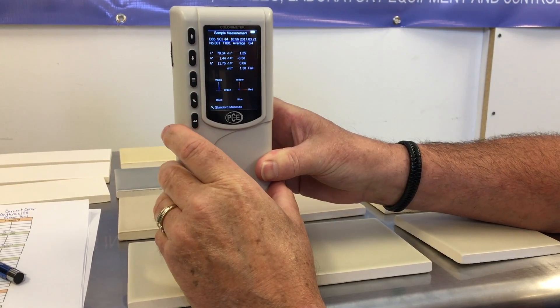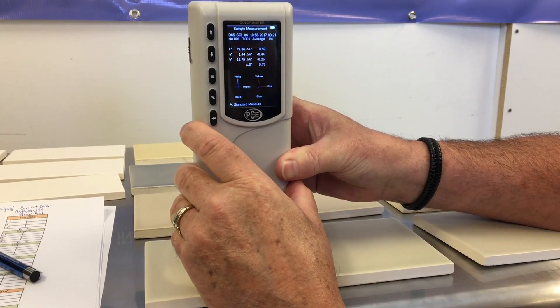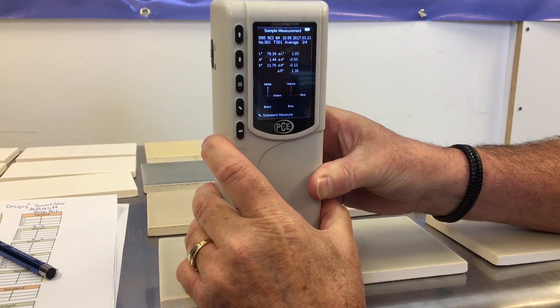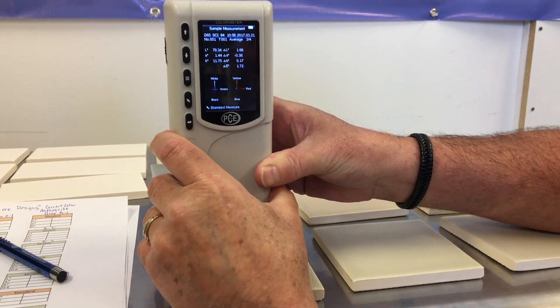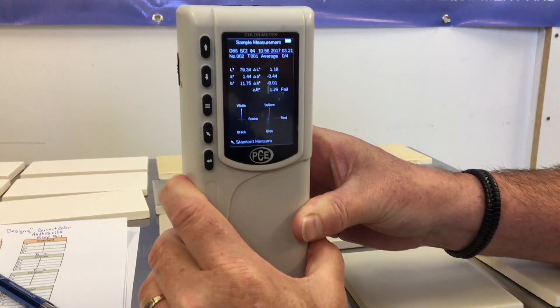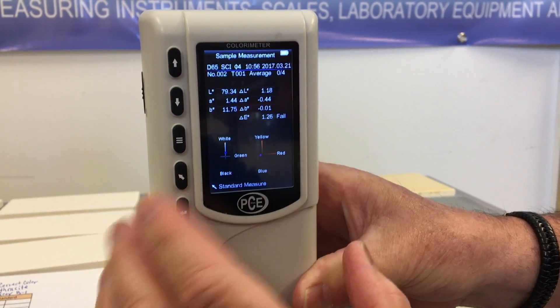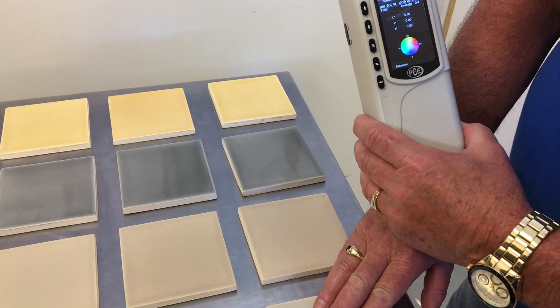Now we're ready to check sample two: one, two, three, and four. We can see that delta E failed on this color by 1.26 from our standard. There's our standard on the left. Okay, we're finished with this standard.